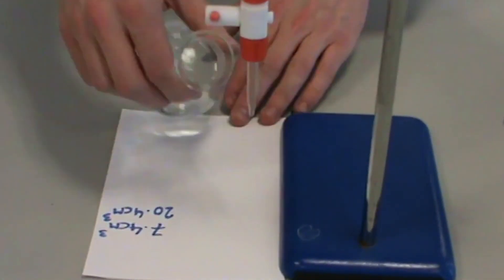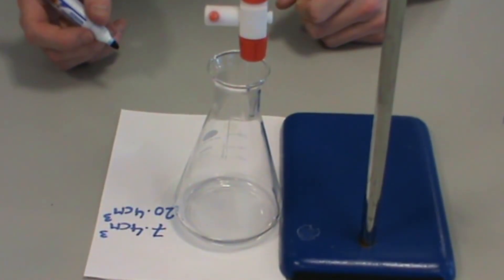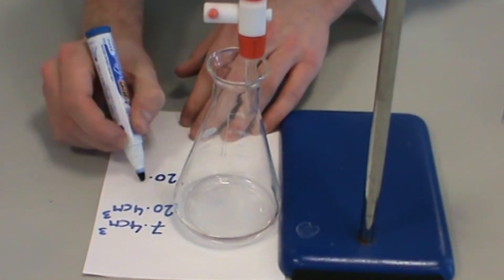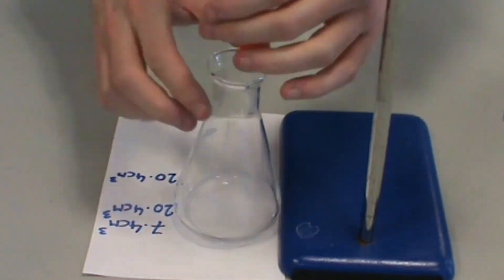Into a new conical flask, pipette 25 cm³ of sodium hydroxide solution. This time, do not add the indicator solution.